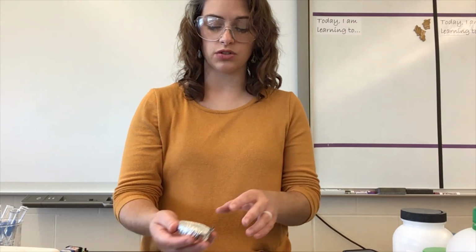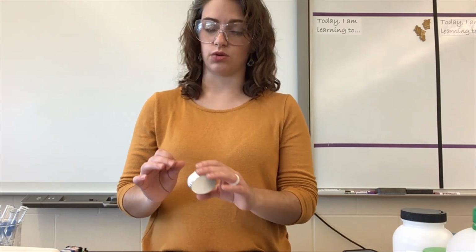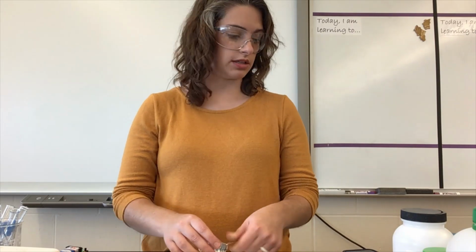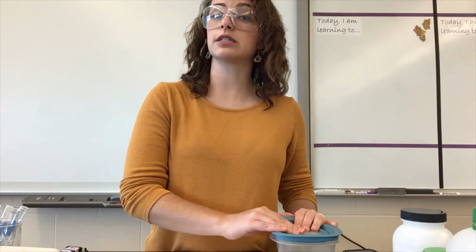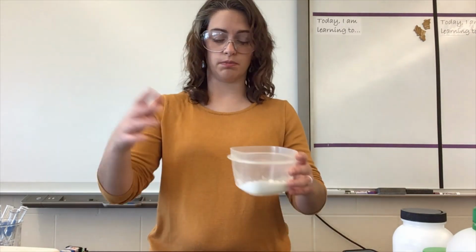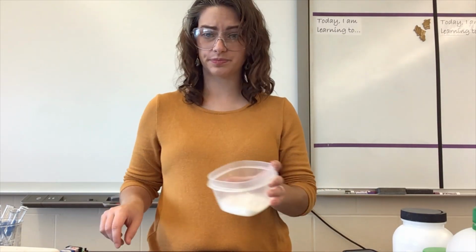So naphthalene is also known as mothballs. So you can actually buy it in the store, and some people like the smell of it. A lot of people don't. So it is a unique smell. And it is a unique experience that you are missing out on since I can't send smell through video, but it smells. I don't think it smells good.